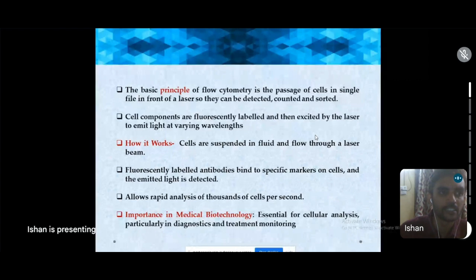It can be collected, and a graph or histogram is maintained which shows different wavelengths of light, from visible light to UV light and other kinds of light being placed on the receiver. It forms an image in the form of a graph or chart where we can assess the complexity of the cell by the form of these lasers emitting wavelengths of different frequency.